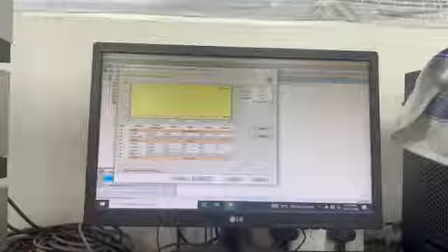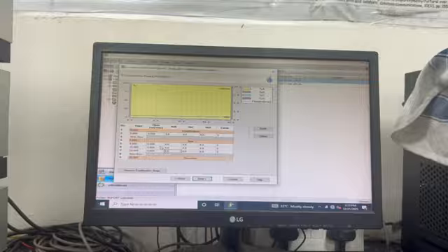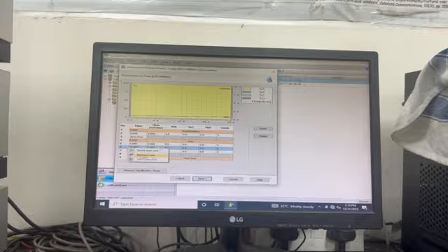We generally don't do these things, but this is helpful when peaks are overlapping. If we want to play with temperature and flow rate at different times, we can. We can delete or insert rows; that's not an issue. It's just for demo purposes, and I came up with a rubbish example.